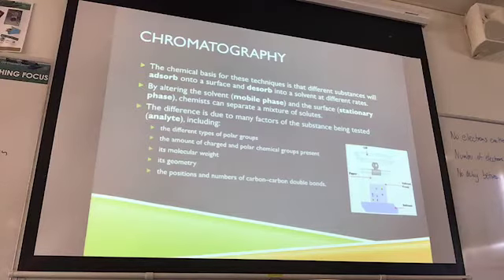So what we can do is we can alter the mobile phase and the stationary phase or the surface, so we can alter the solvent and what we're doing the chromatography through, which will allow us to separate the different mixtures.